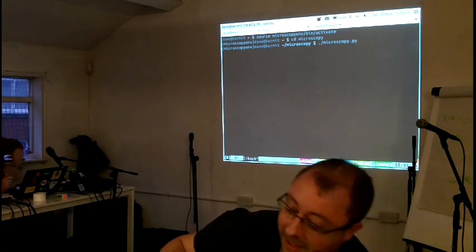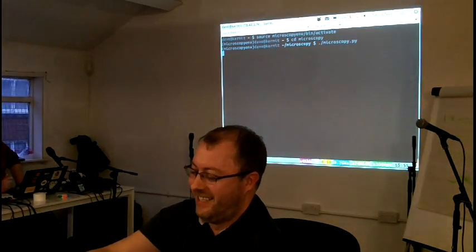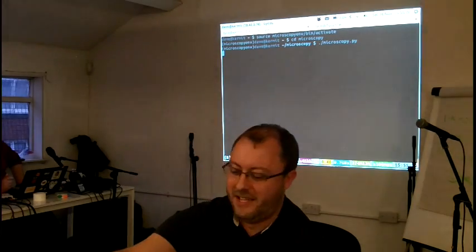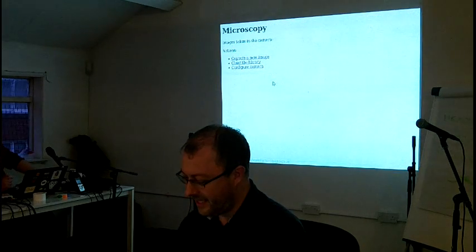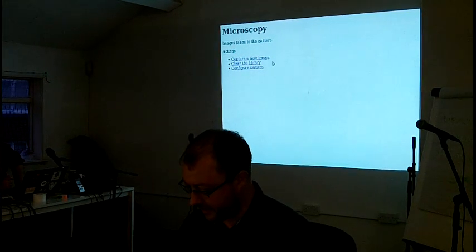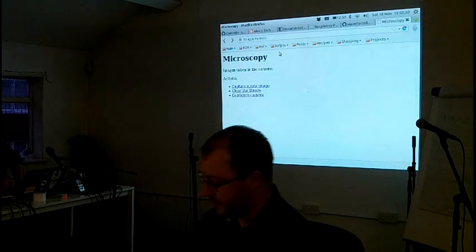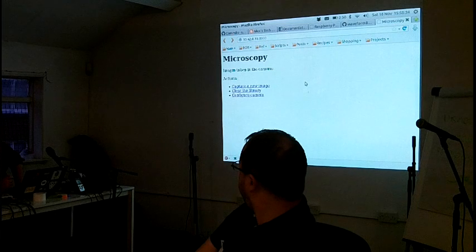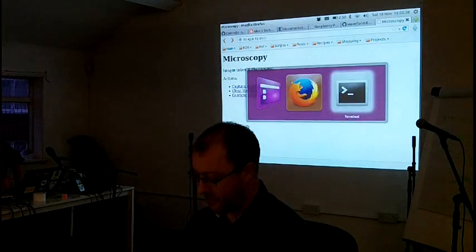Yeah, used to that this morning. So, you should have your wonderful visage on the screen now. And if we go and have a look over here, we may even find that we have the actual web interface running. We do. We can actually reload that, just to prove that. So, can we get that to capture an image?